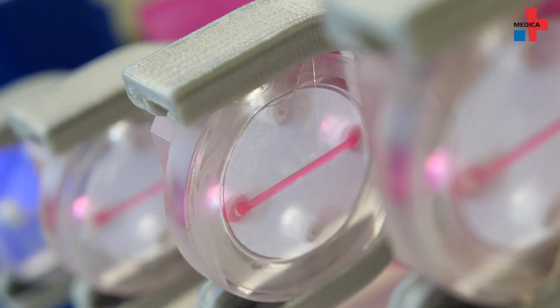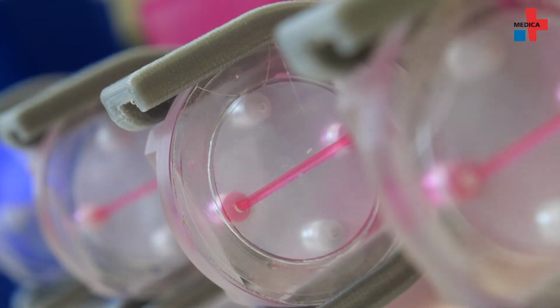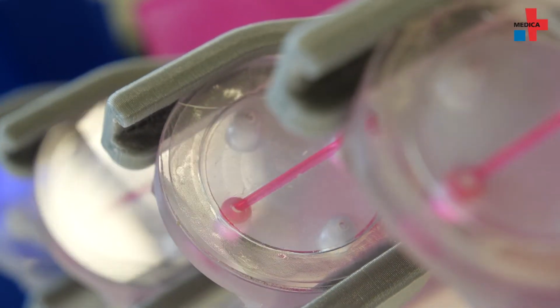Organ chips make it possible to determine the efficacy of an active substance or medication in an early stage using human tissue. That's why this method could eventually also replace animal testing.